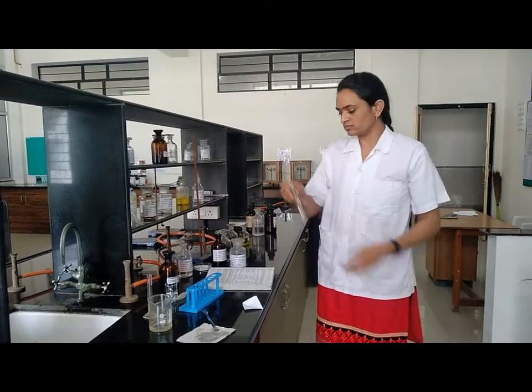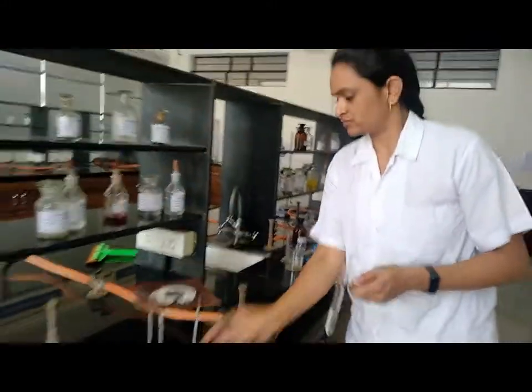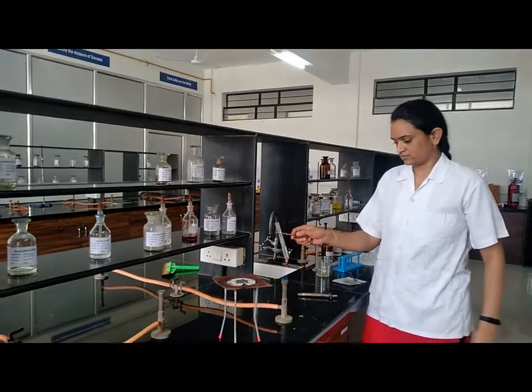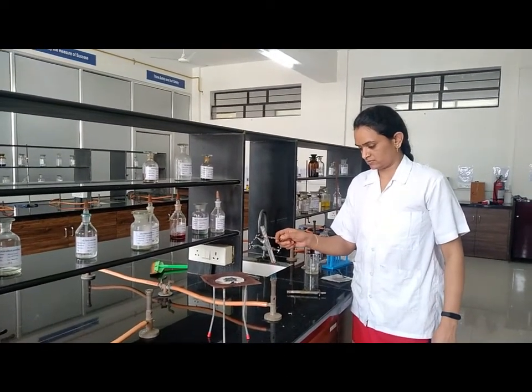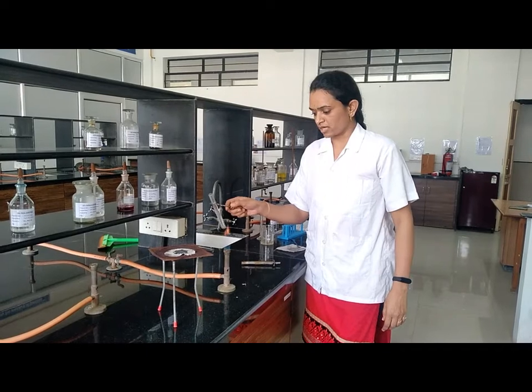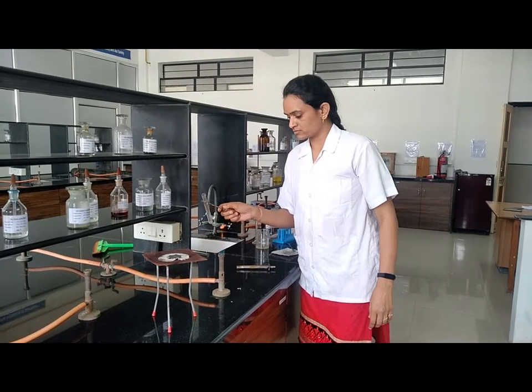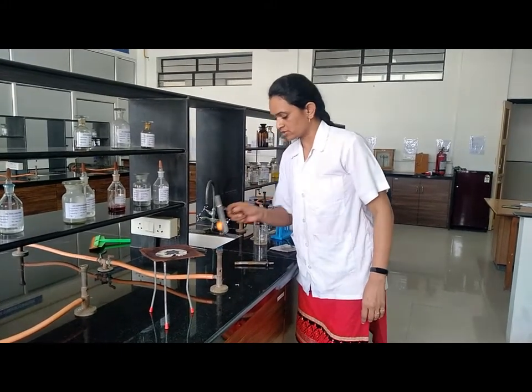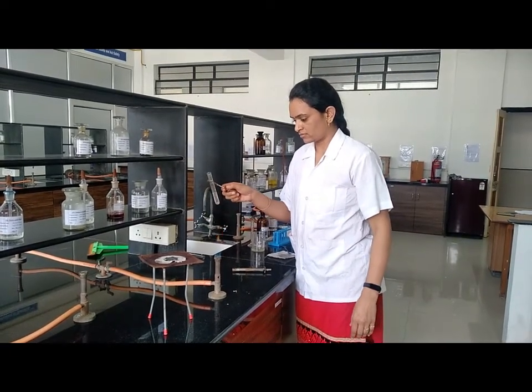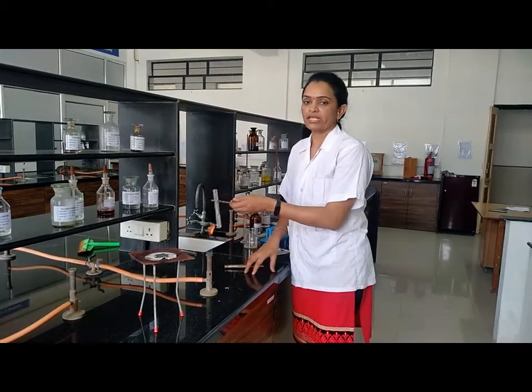Then warm this solution. After slight warming, we get the odor of acetic acid. The odor of ethyl acetate starts.